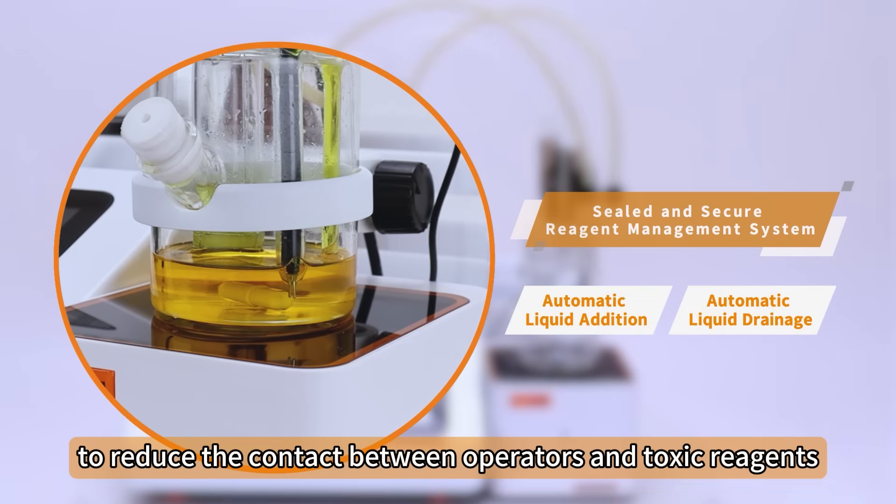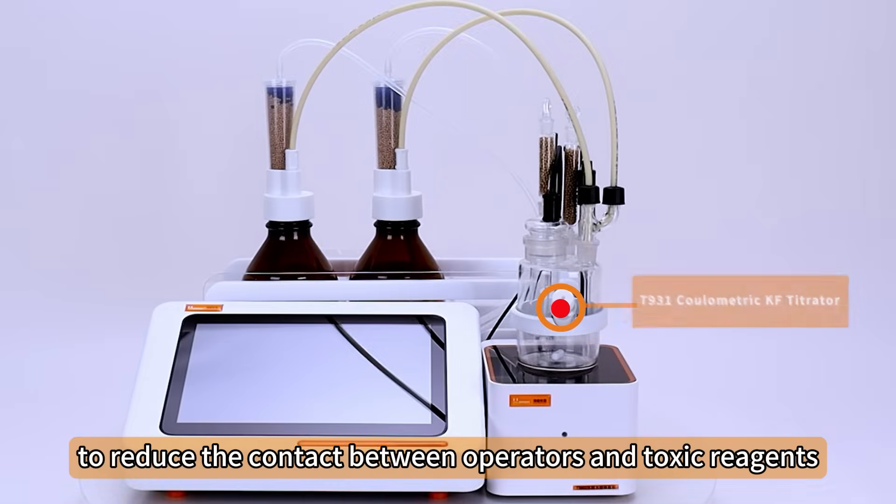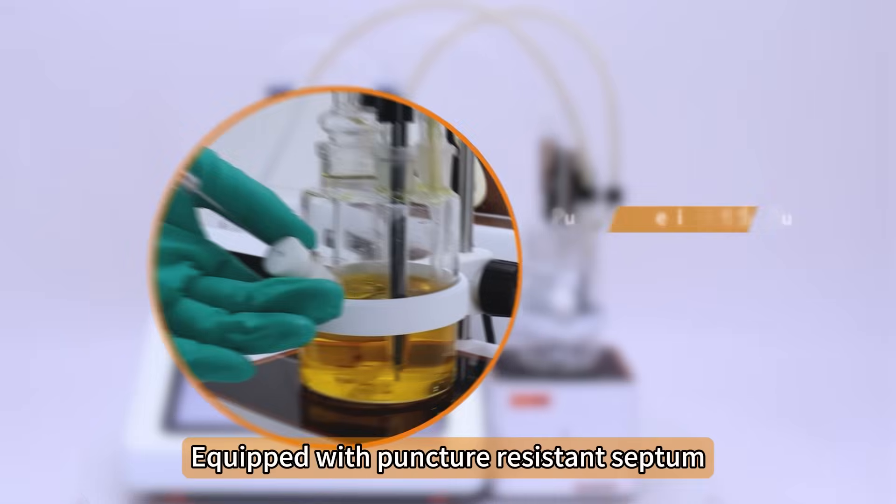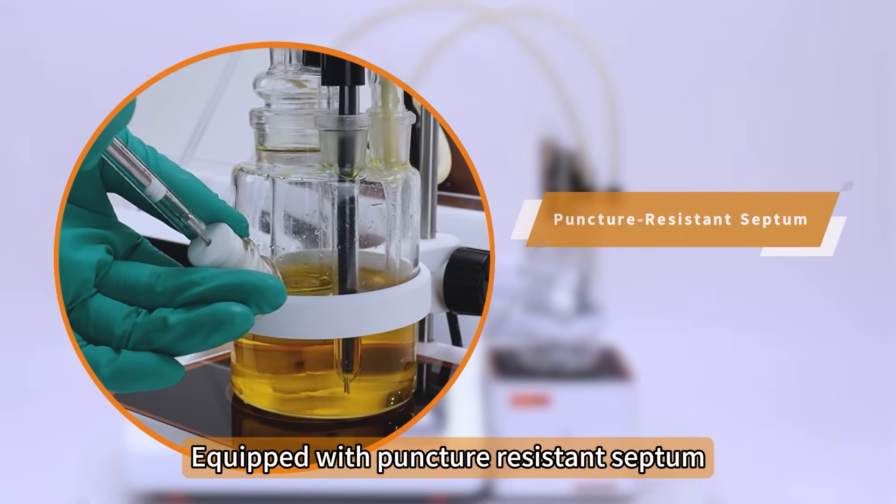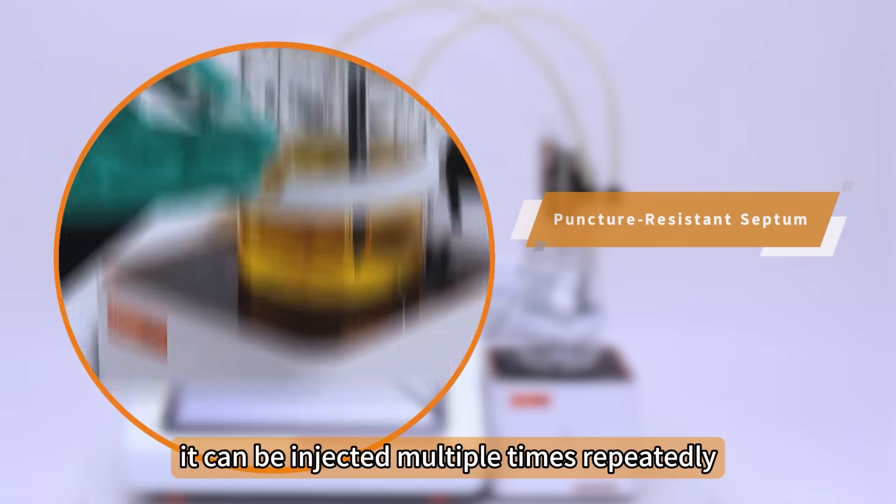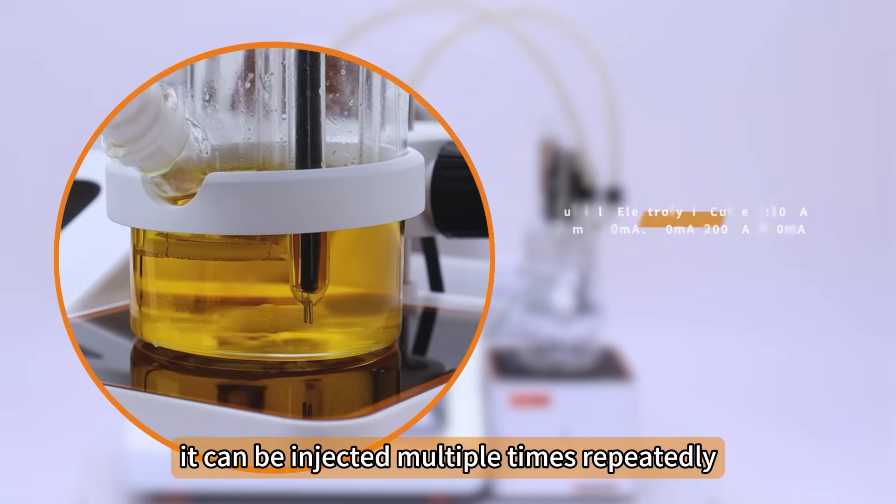To reduce the contact between operators and toxic reagents, the system is equipped with a puncture-resistant septum that can be injected multiple times repeatedly.